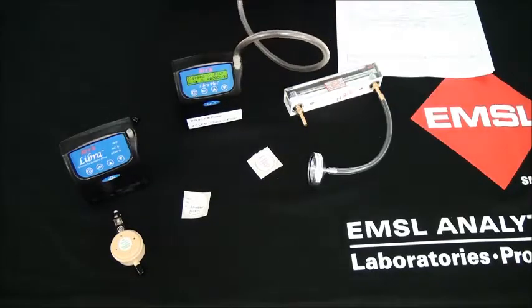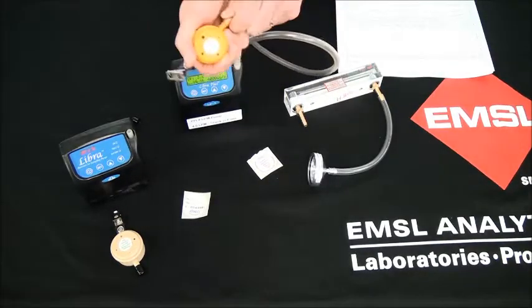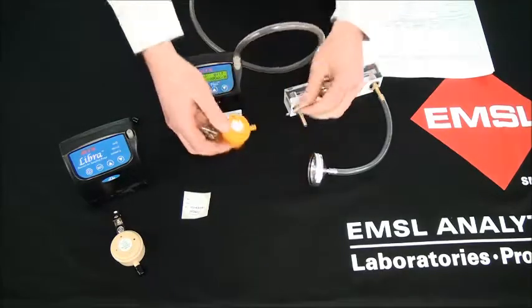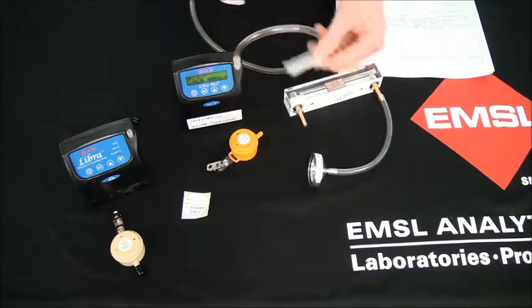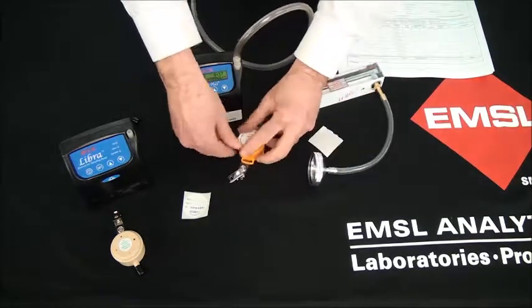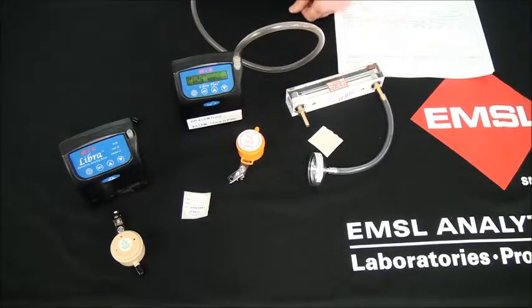At the end of sampling, remove the PPI from the pump. You can attach a sticker to the face of the PPI to prevent the introduction of foreign particles into the sampling media prior to submission to the laboratory.